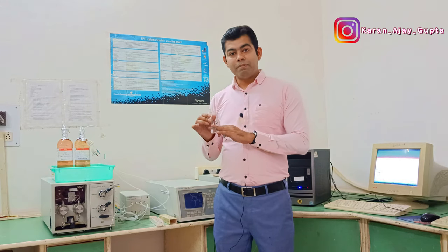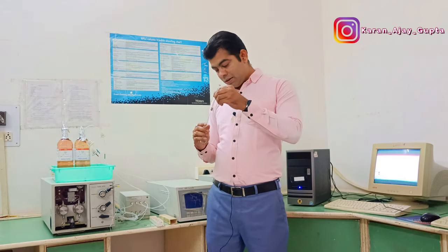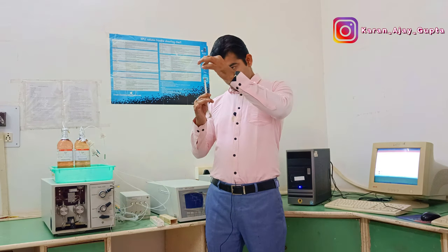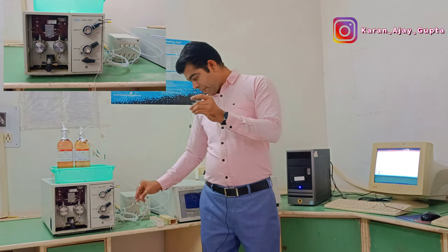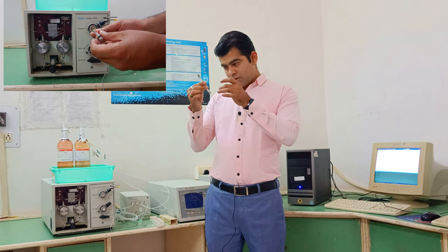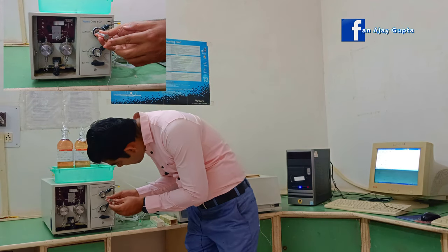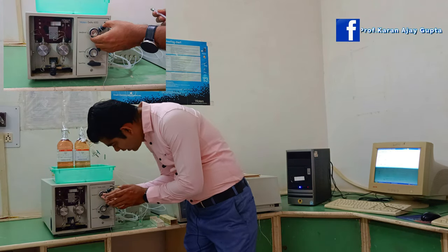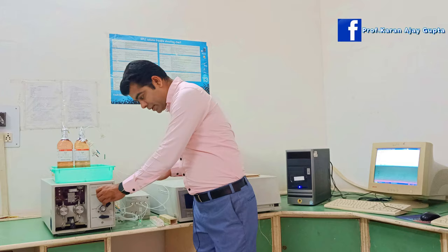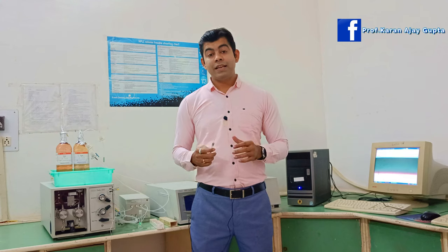Okay, so I filter this sample. Then you have to take this sample. Okay, and remove the bubble first. Okay, and then inject. It is the load condition and then inject. Now our sample is injected. Let's go to the computer screen and see our sample run.